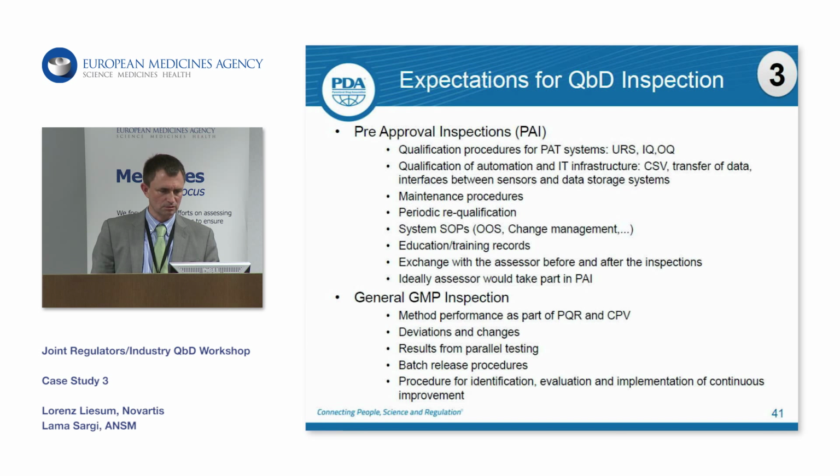Another point we would like to stress during such an inspection is whether a periodic requalification is implemented and which topics are included in this. And of course, some other points you might know from routine inspections too, like implementation of a maintenance procedure and the system SOPs, how to handle change control and out-of-specification results.